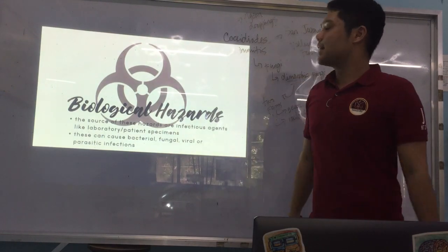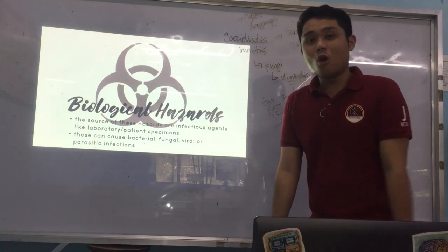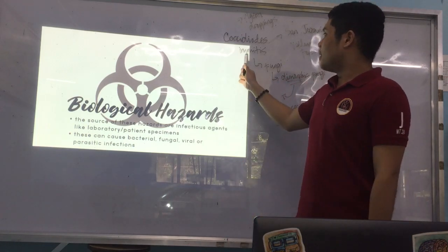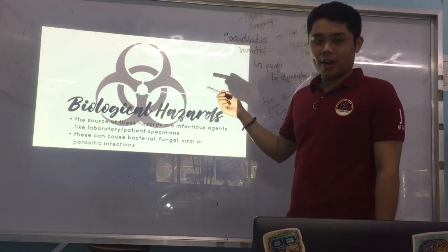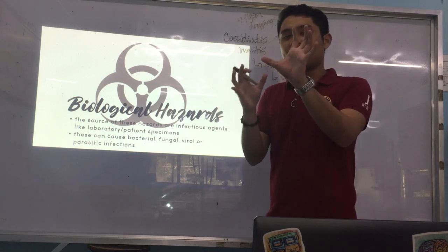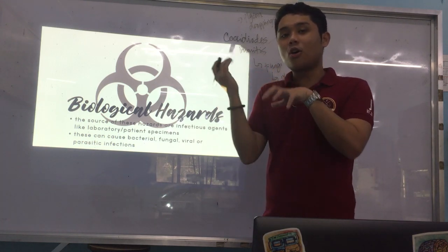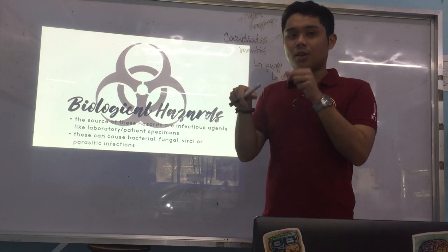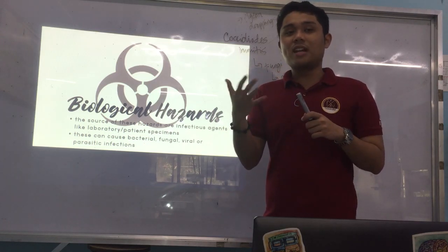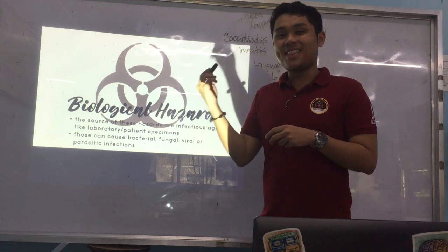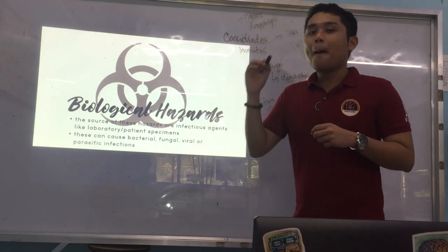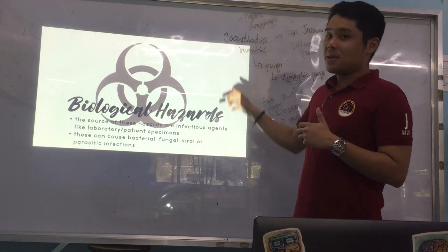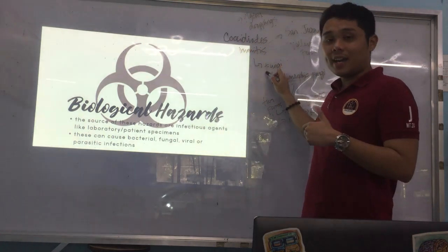Coccidioides immitis is the most harmful biological hazard to laboratory personnel because it releases spores. In the lab, if you have plates where Coccidioides immitis is cultured, they should be taped around the corners so that spores cannot be inhaled by lab personnel.